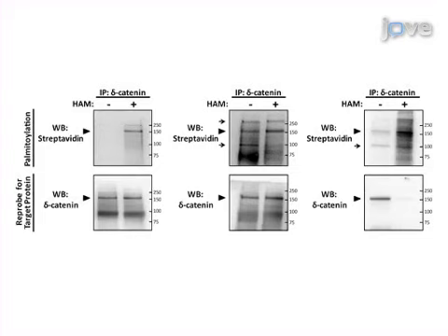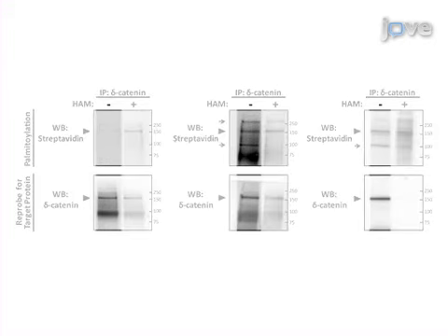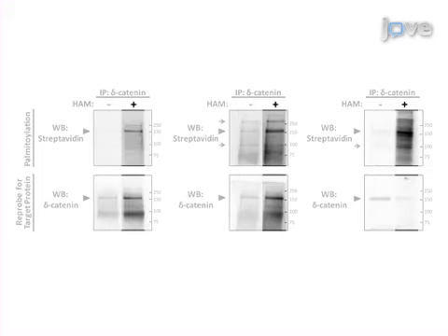The omission of HAM cleavage prevents the incorporation of biotin BMCC and functions as a negative control for specific palmitoyl biotinylation of the plus HAM sample. Therefore, the minus HAM control should always be run adjacent to the plus HAM sample for Western blotting by SDS-PAGE.